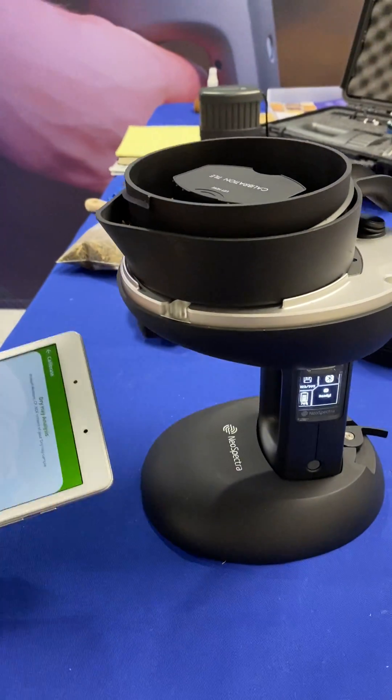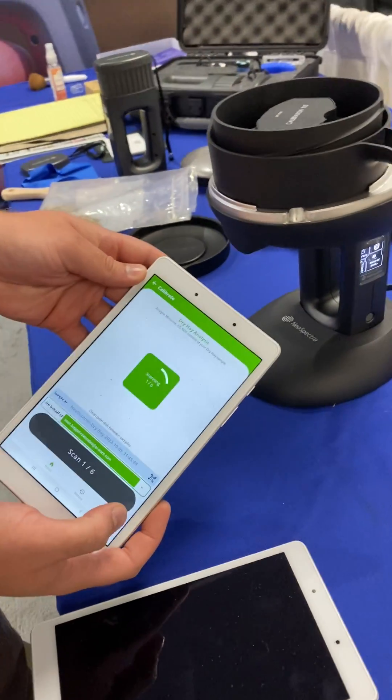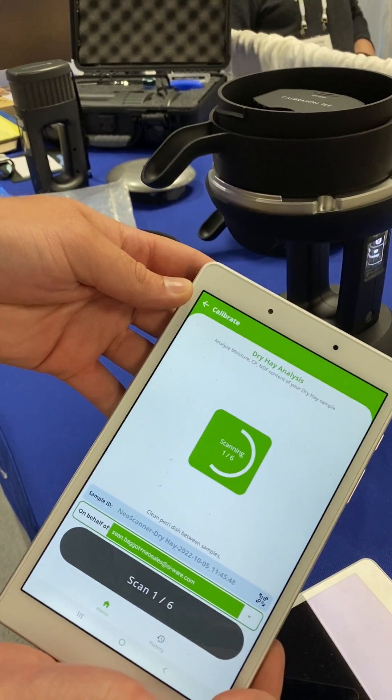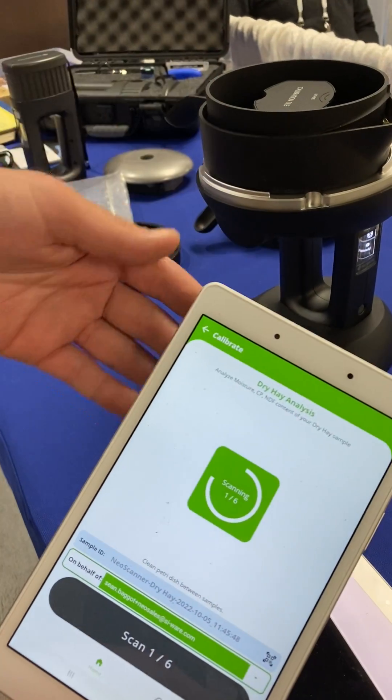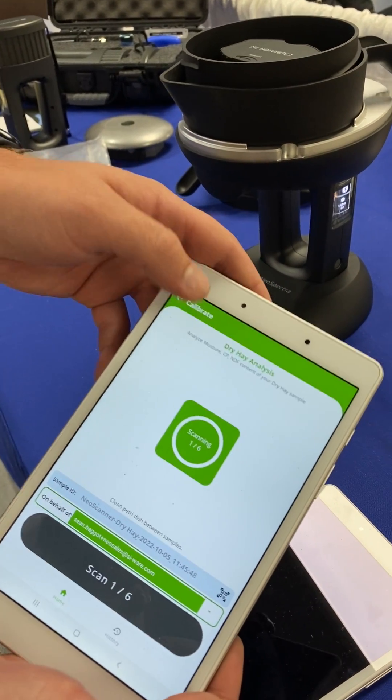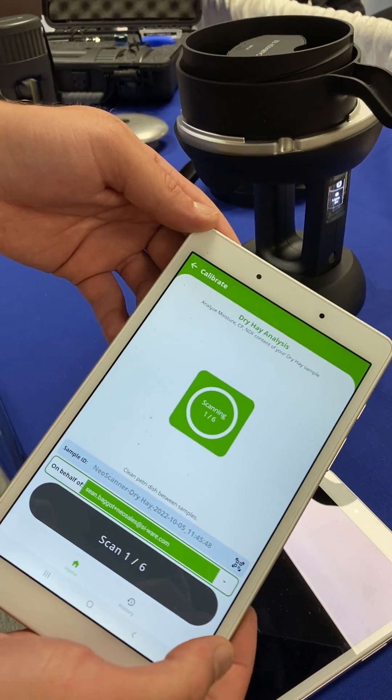Inside the mobile app we'll go ahead and click scan, and this will run through six sub-scans and then average those together to give you your final result. This calibration is testing for moisture, crude protein, and neutral detergent fiber.